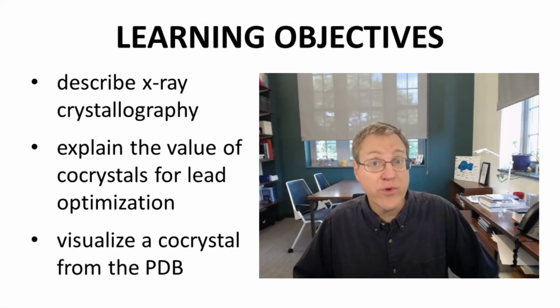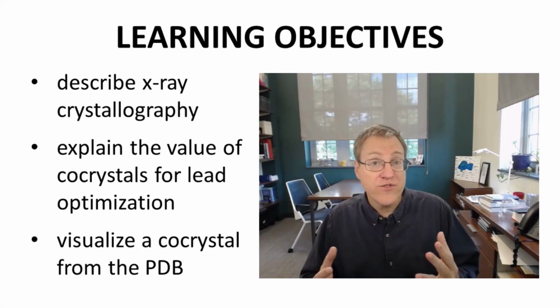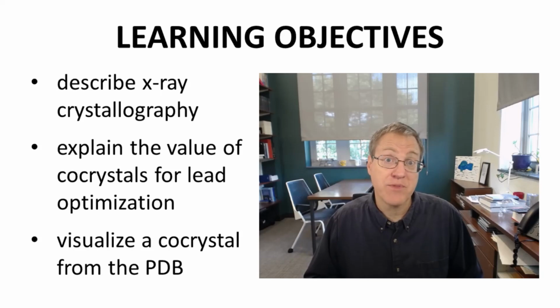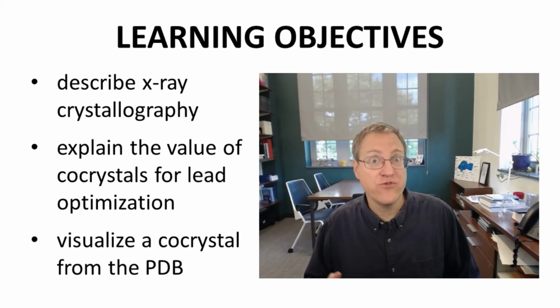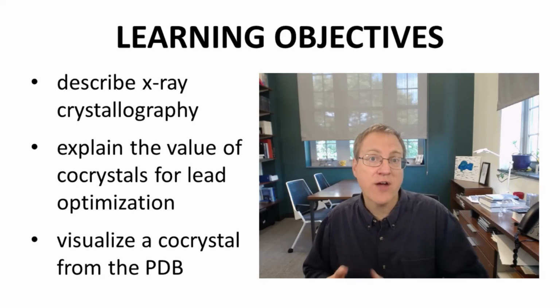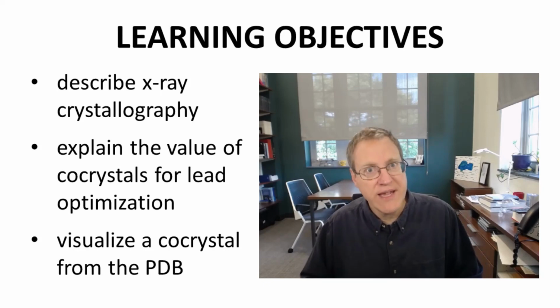We discussed X-ray crystallography as well as the use of cocrystals, specifically in the context of lead optimization. We also visualized a cocrystal of imatinib and a tyrosine kinase from the Protein Data Bank.